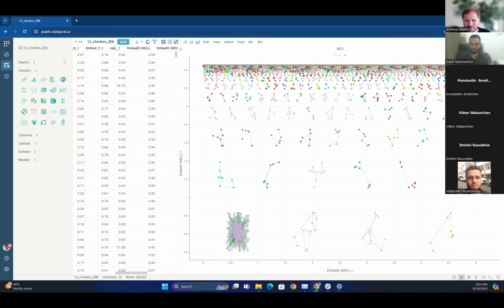Yeah. And as you mentioned, there are some available options, but I'm not aware of any that allow you to do as many things together as ours. And also the ones that can run on GPU don't allow the use of these complicated distance functions, which are applicable to molecules, macromolecules, and so on.